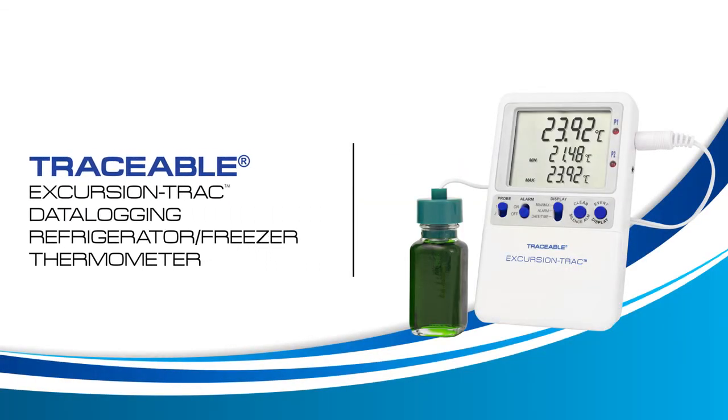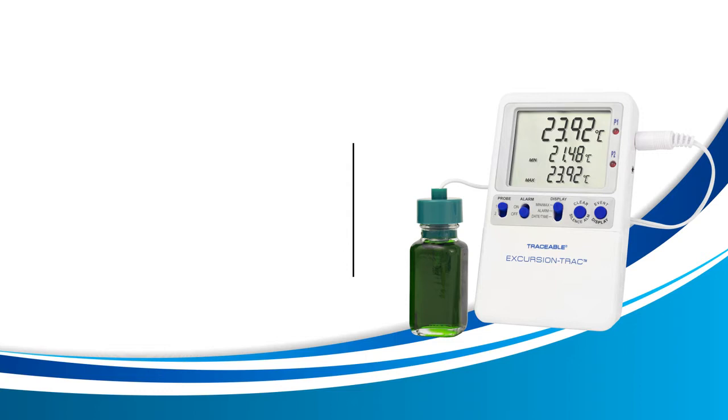Welcome to a Traceable Products instructional video for the Traceable Excursion-Trac thermometer. In this video, we will learn how to set the day and time.